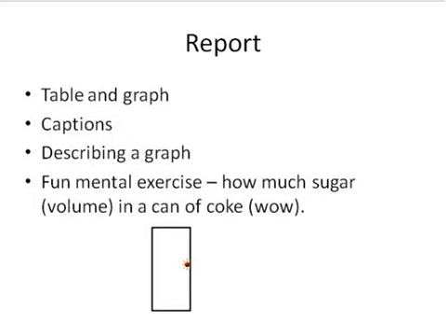Okay, so that's all I wanted to do here, and you know, have fun with this experiment. It's one of those real life connections, but the whole idea of calibration is very, very important in chemistry, and so that's the chief thing that we're trying to get across to you in this experiment, is this idea of making measurements and constructing a calibration that represents the relationship between the measurements and the desired property. So hopefully you'll get a lot out of this experiment and have some fun with it.